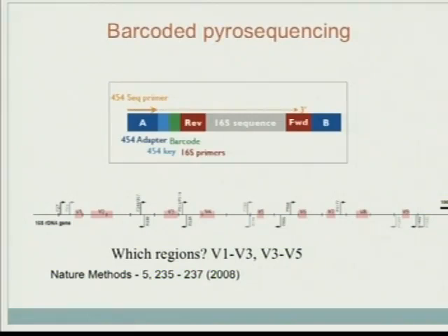So there are, I'm just curious, so many different microbial species. Are you assuming that all the 16S genes have this structure? Yes. As I said, 16S is one of the most conserved genes. As long as these bacteria should have this, they should be similar in some sense. They should have very complicated structures with stems, with loops, and also those conserved regions. You will even be able to come up with primers so that they will bind to all those regions. So you may miss some of those, the very strange ones, but hopefully you will get most of them.